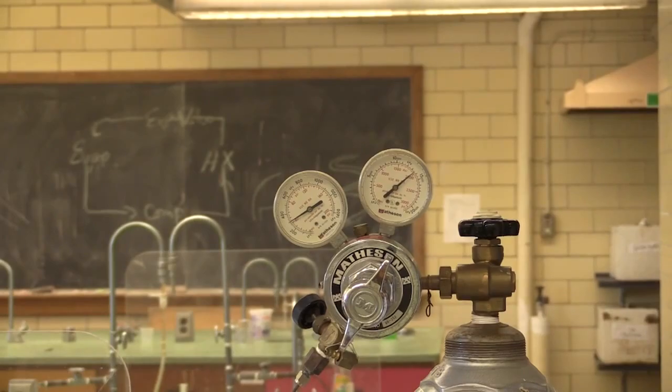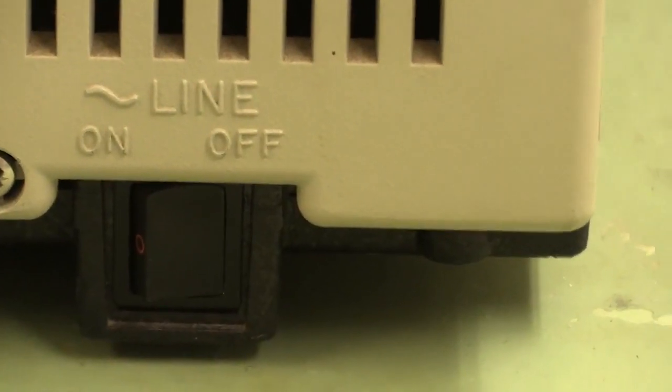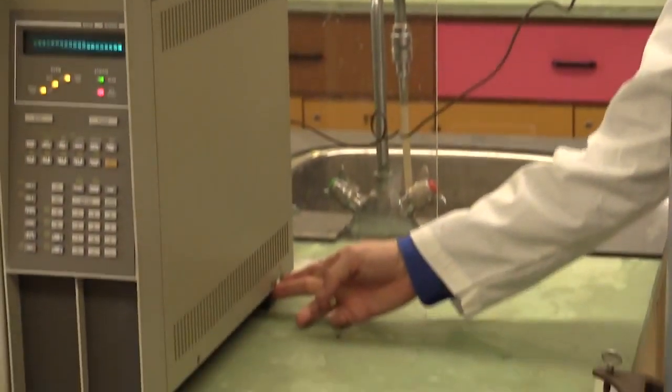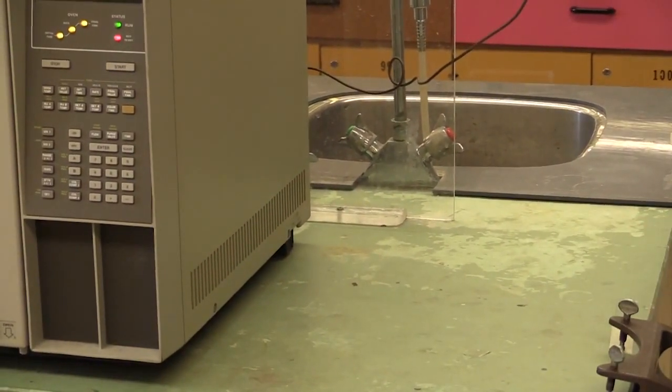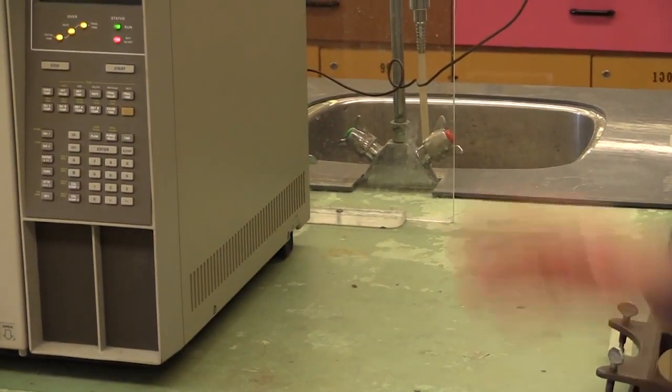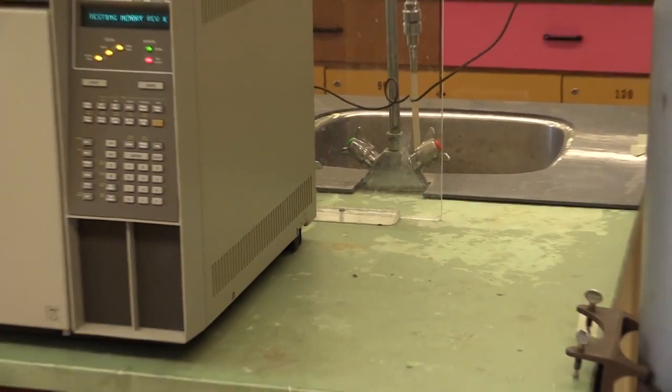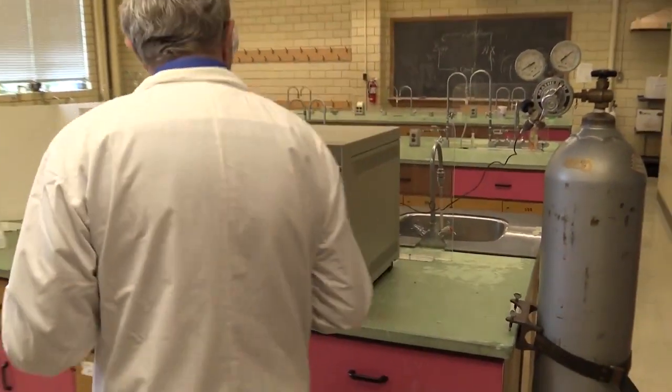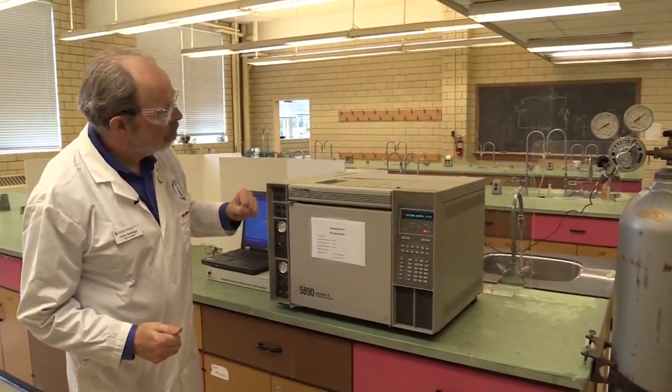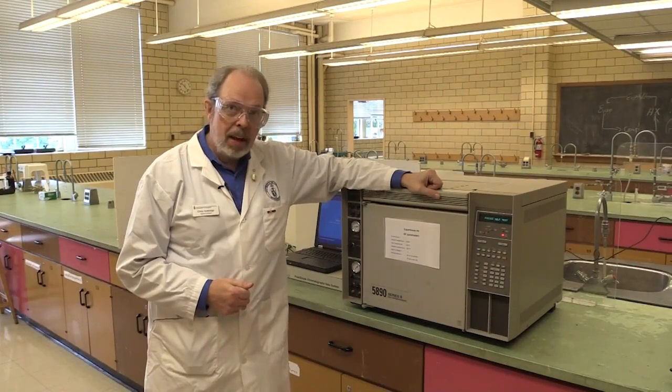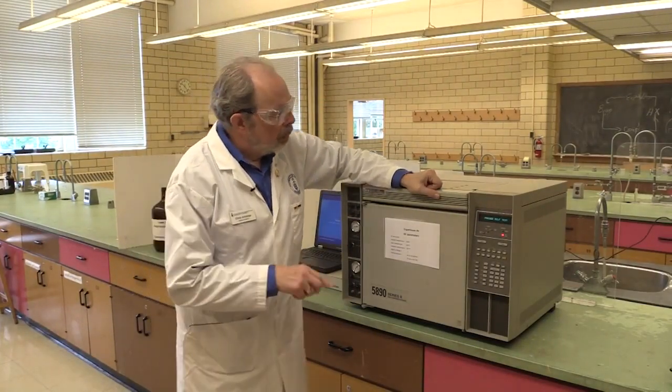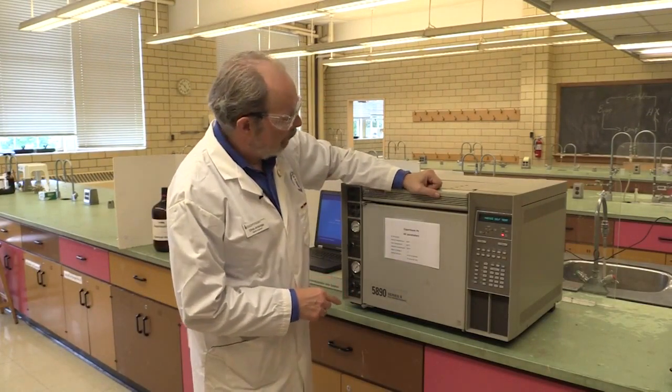The other thing to do is actually turn the electrical power on, and that is right here. And that should be coming on now. It's starting its self-test. Moving back over here. All right, it's now passed its self-test, and we check for the parameters. We've actually labeled the parameters here. Some of them will have stayed in the instrument's memory.